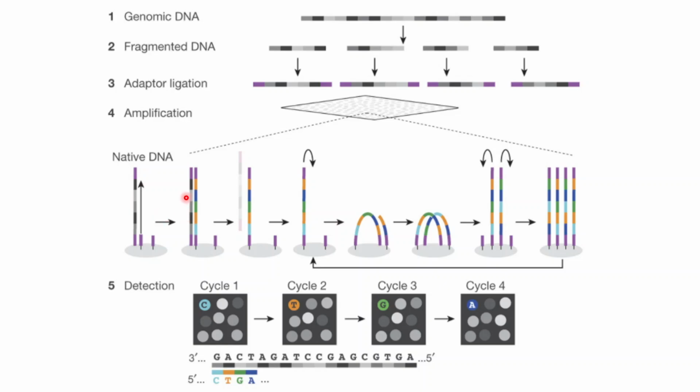So coming back to the introductory part of how these reads are formed, basically if you look closely, whenever a base is added, the sequencer actually processes it out. So what is happening is that the dNTP, the nucleotide triphosphate that is added into a flow cell or the sequencing platform, is actually fluorescently labeled.